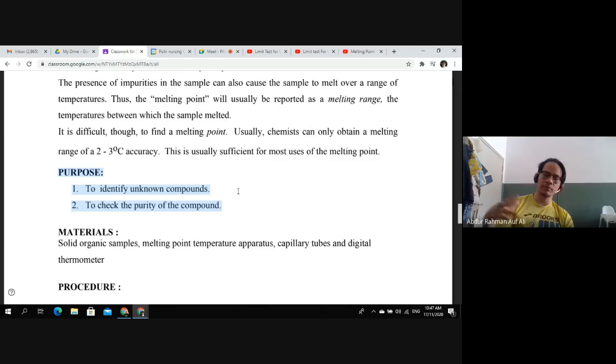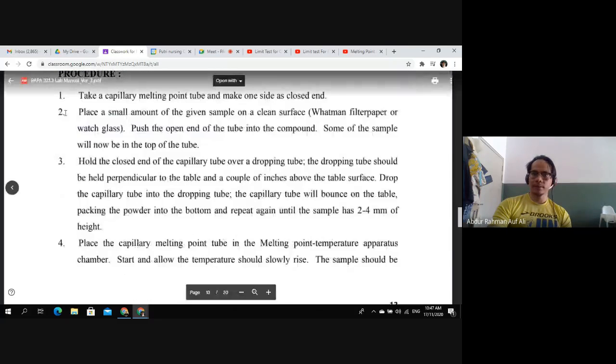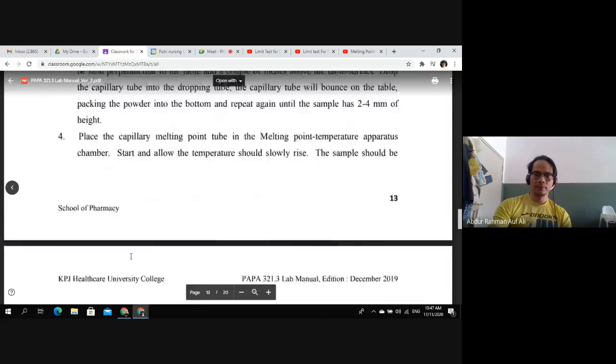So kita kena perform more tests, okay, assay test to actually determine the amount of paracetamol content. Kita buatlah titration macam kita tengok semalam. Bila kita buat titration, we can actually determine the content, the amount, gram, and juga purity of paracetamol. Kita buka pharmacopoeia, how to perform titration, chemical apa nak guna, how much, what is the molarity of the standard solution. Standard solution apa kita kena pakai, boleh guna sodium hydroxide juga apa. That is all dependent on the pharmacopoeia of that sample. Okay, so the procedure is the same macam dalam video yang kamu tengok tadi.